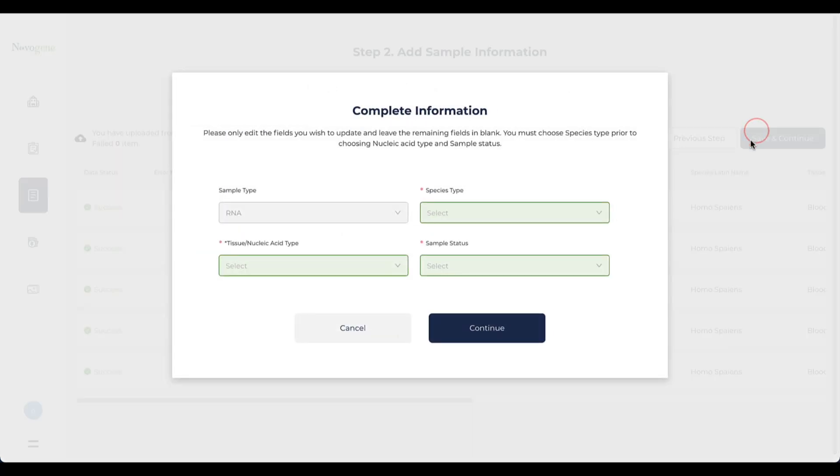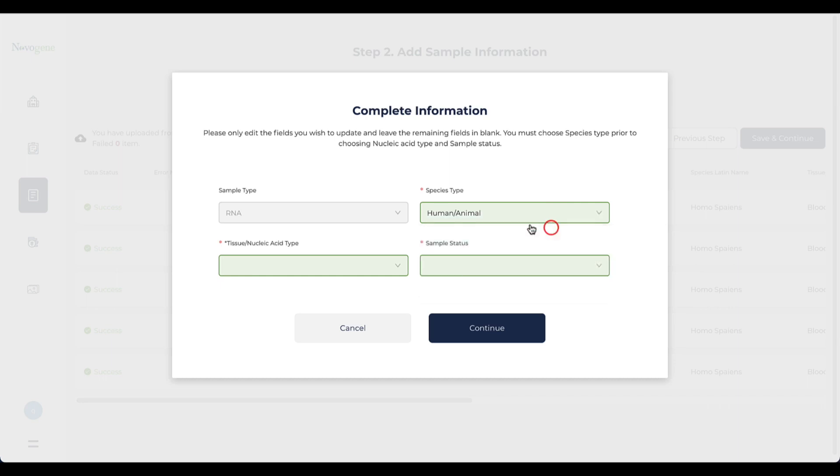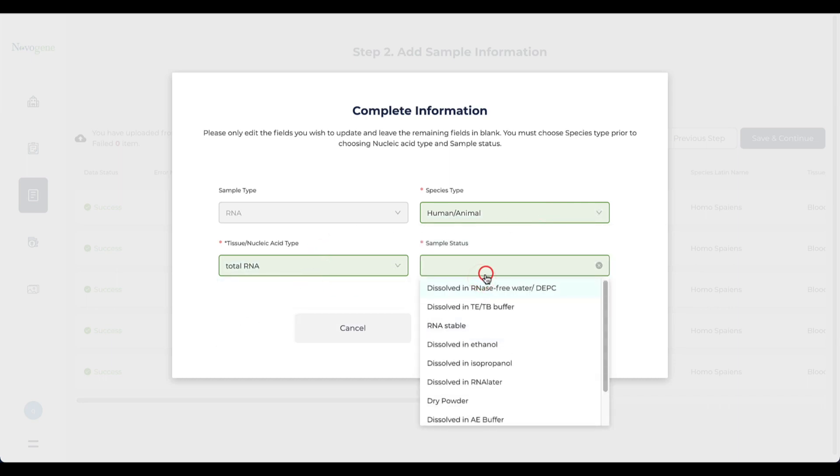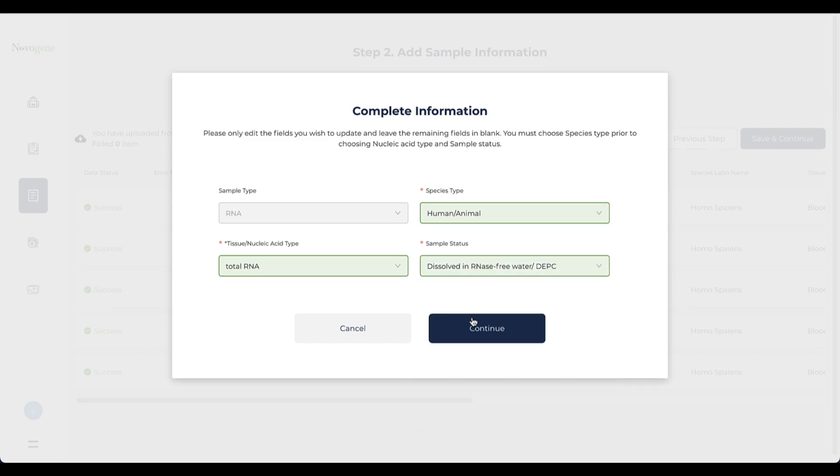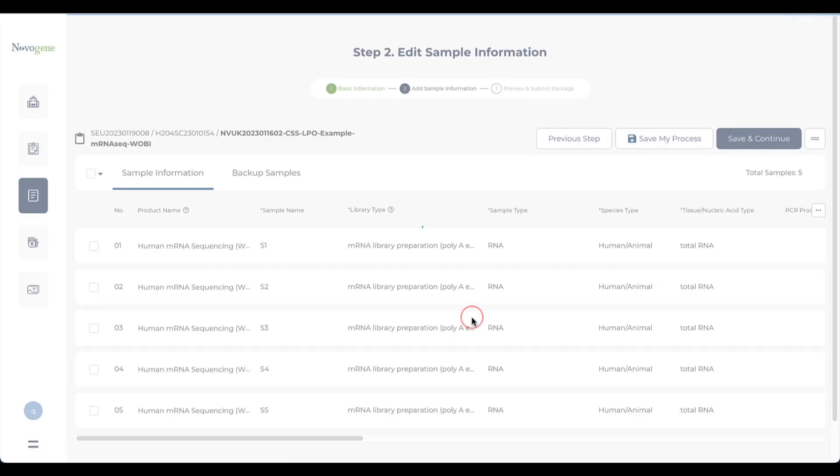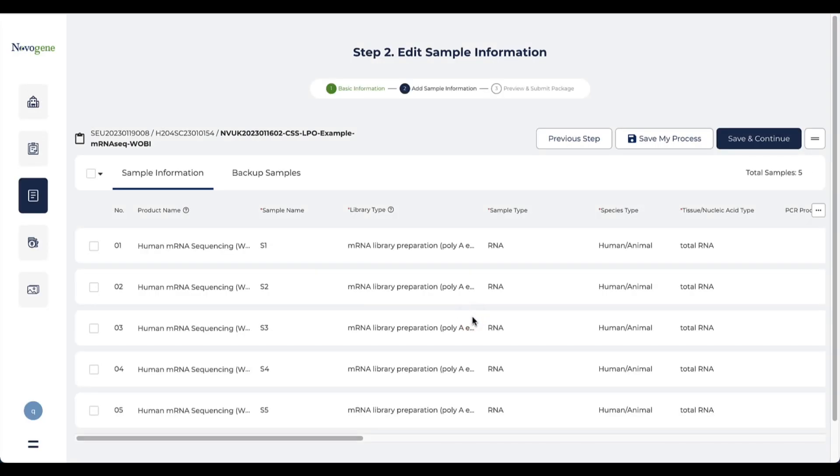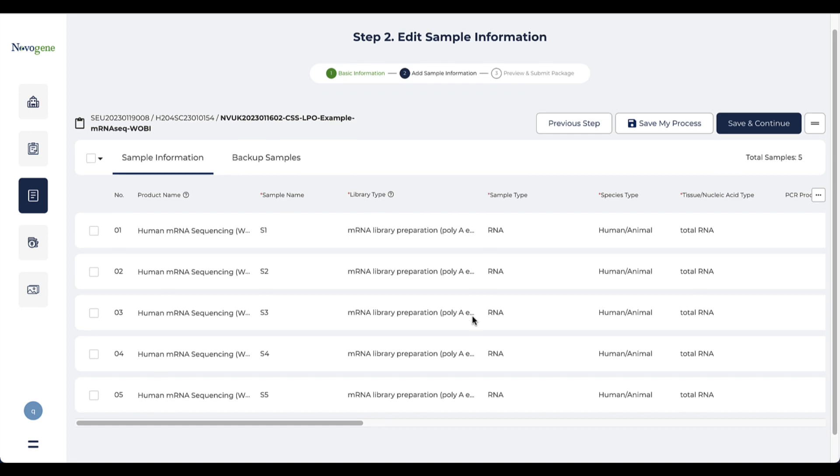Click save and continue. You may need to select the additional information for this batch of samples like sample status and sample type. This can help us to arrange the correct sample quality control protocol for your samples.